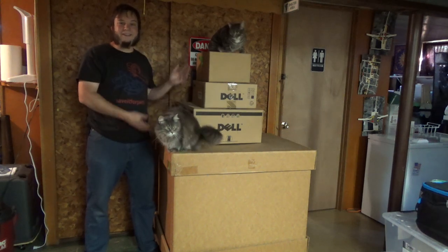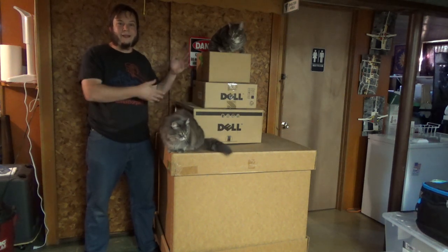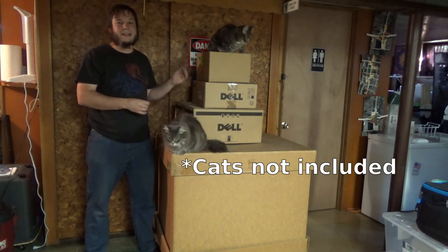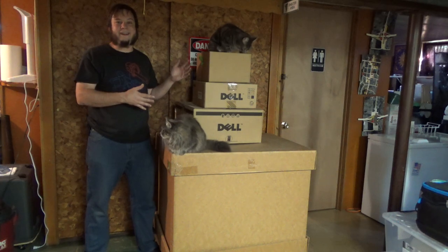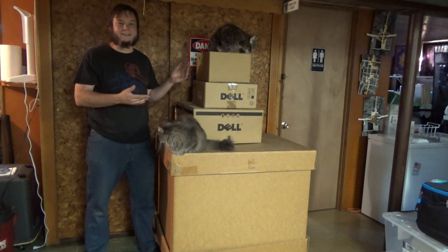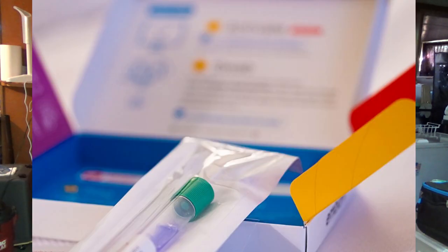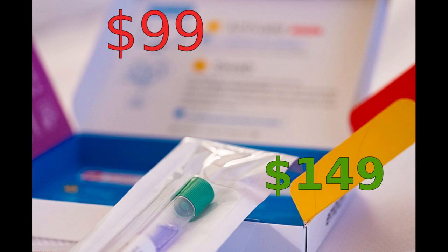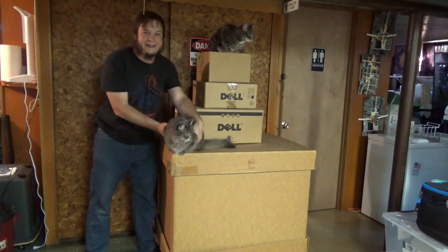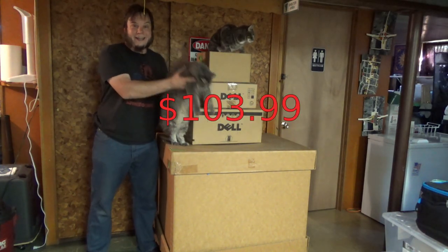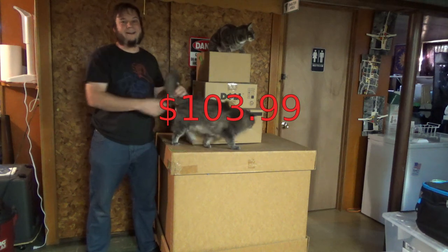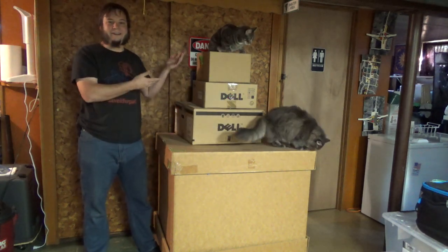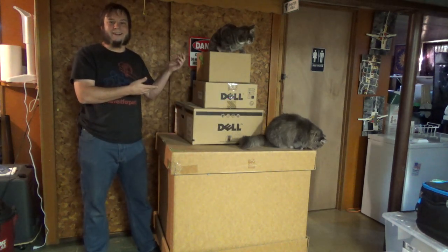Now my winning bid on this entire thing, all this stuff was $85. That's less than a home DNA test that I've seen advertised on TV. Those things go for $100, $150, over $200. Heck, even getting your cat's DNA tested is over $100, so I think I got a pretty good deal on all this junk.